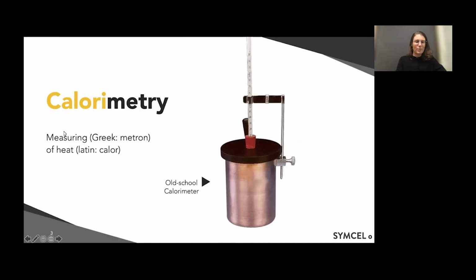Calorimetry basically means measuring heat. And I don't know how many of you are familiar with calorimetry, and especially I think not so many will be familiar with calorimetry and applications in biology. When I started to study biology 17 years ago, one of the first labs we had was actually physical chemistry. We had to do an experiment with a device that is shown here on the picture.